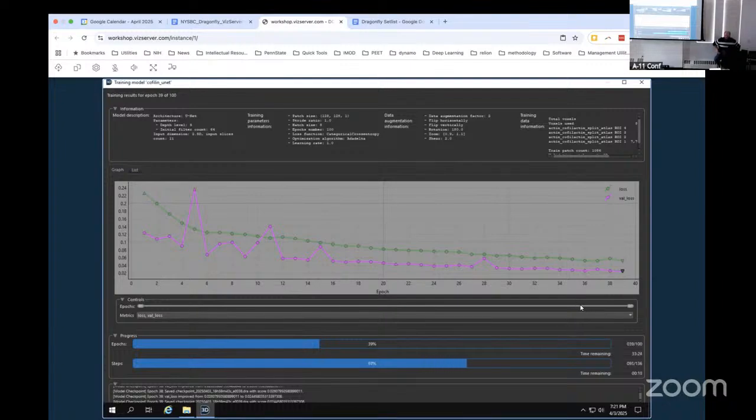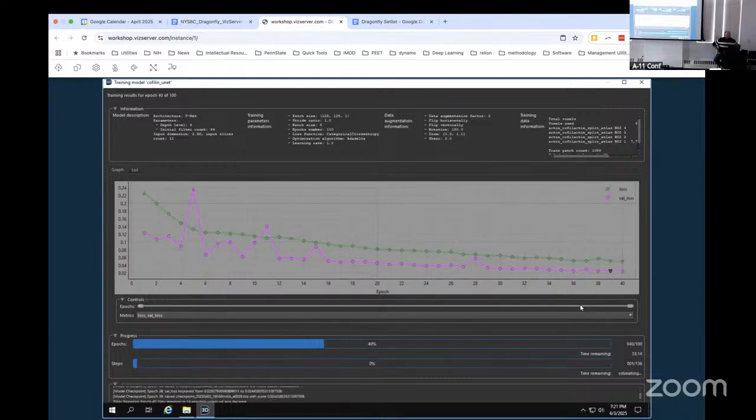Tomo Live? No, she has a field with one structure in it, not numerous. I don't know whether an AI can operate on low statistics like that. Oh, I see. You mean it's a crowded environment, but there's only one? No, there's empty space and then one very large tube. I don't see why it wouldn't work. I think my issue is that it's not filling in the wedge to make it a circle. I see, on the segmentation.